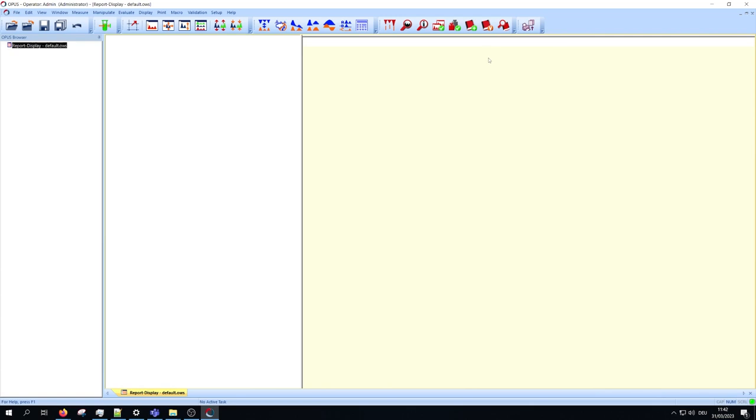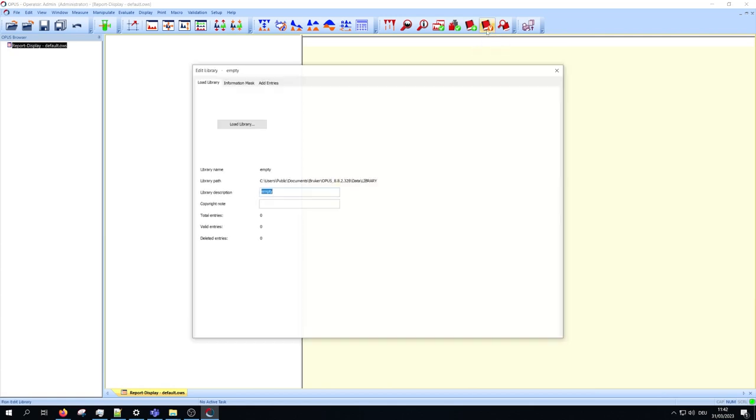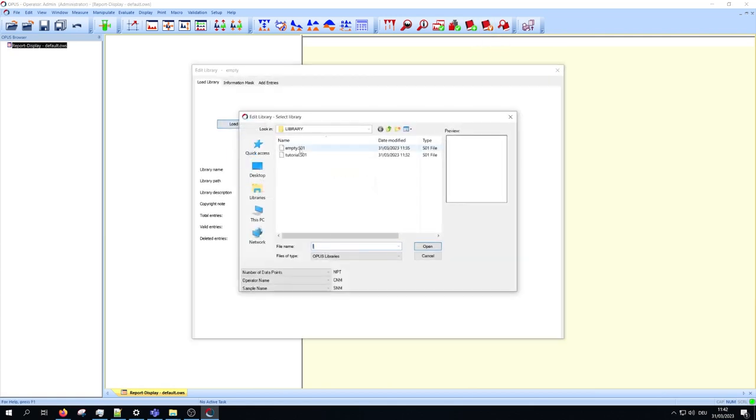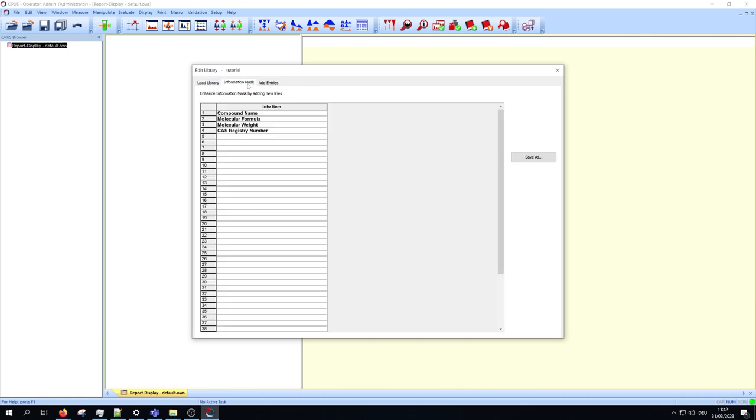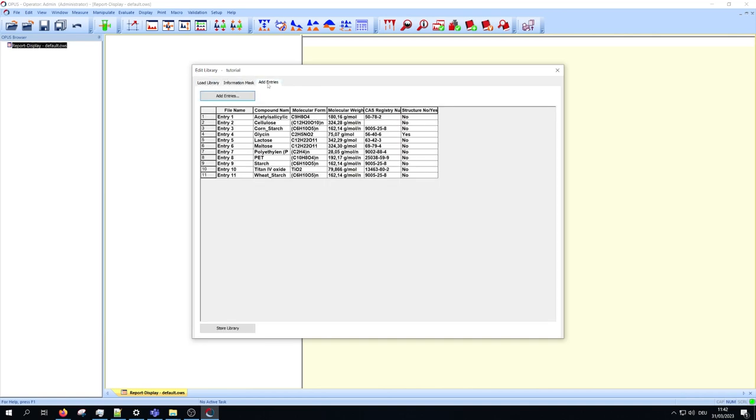If you want to edit the library, for example to expand it or remove an entry, open the edit library function. Load the library you want to edit. You can change the description, the copyright note, the information mask, and the entries. Don't forget to store your library afterwards.